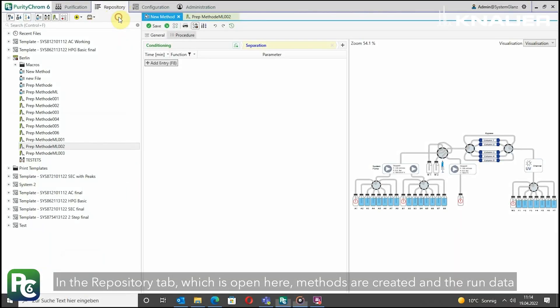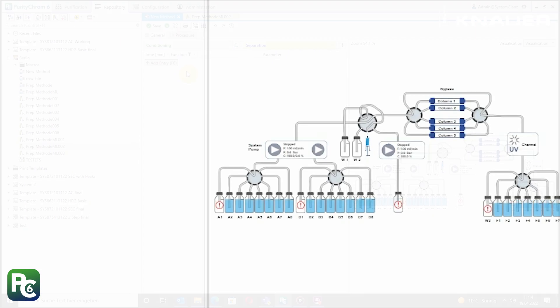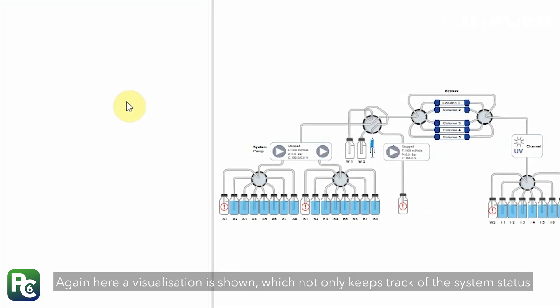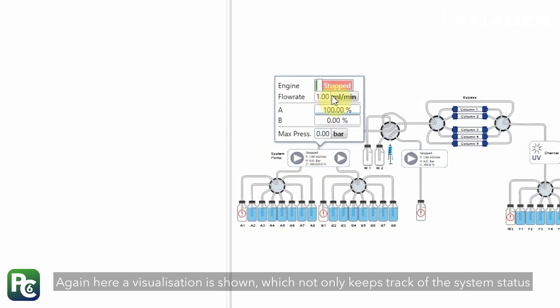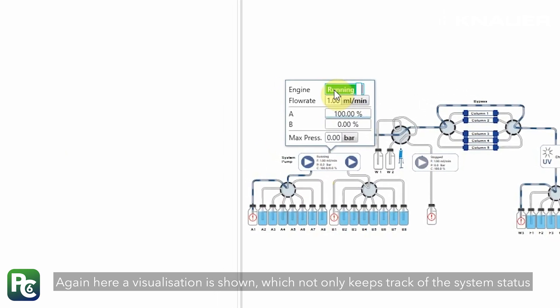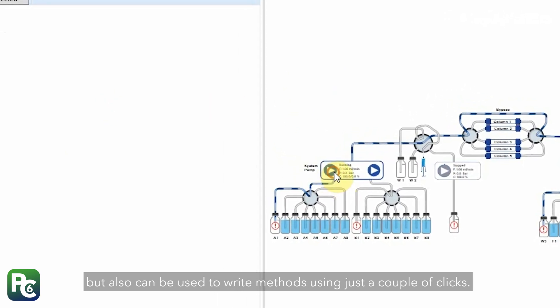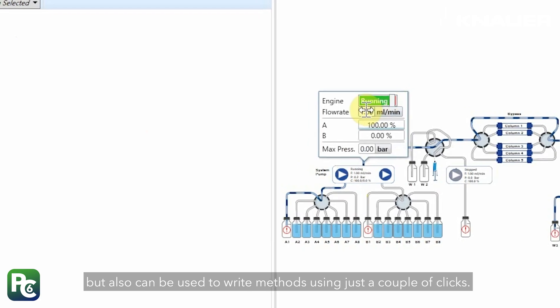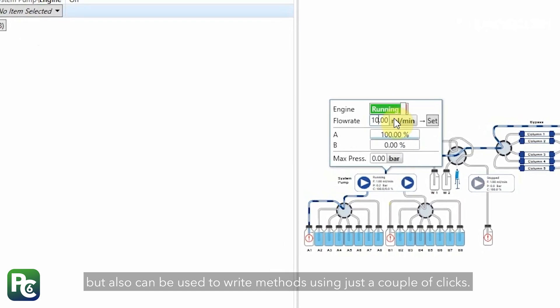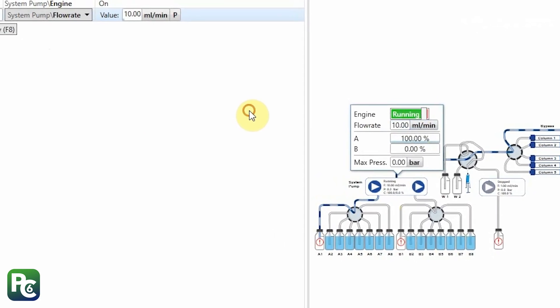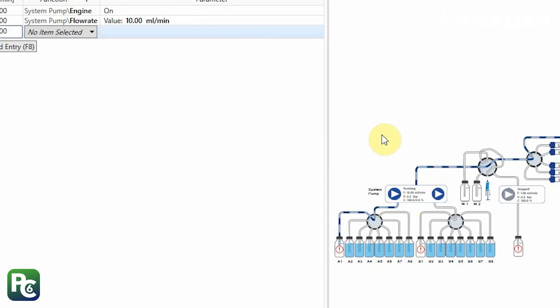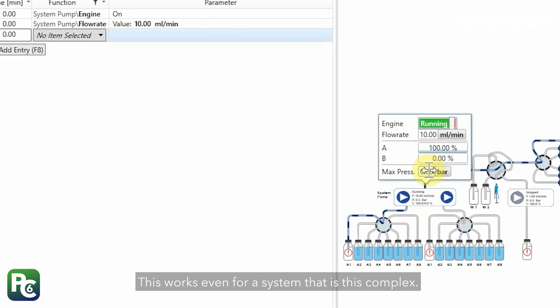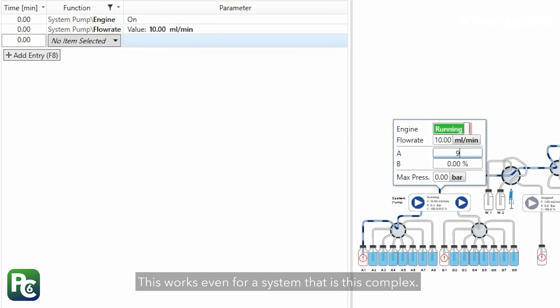In the repository tab, which is open here, methods are created and the run data can be analyzed. Again, here a visualization is shown, which not only keeps track of the system status, but also can be used to write methods using just a couple of clicks. And this works even for a system that is this complex.